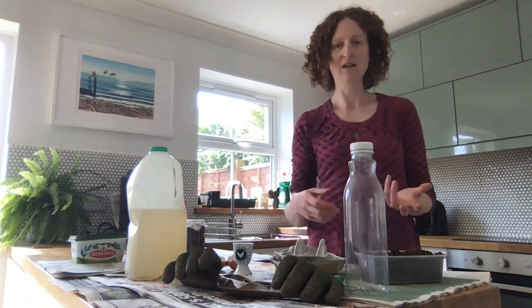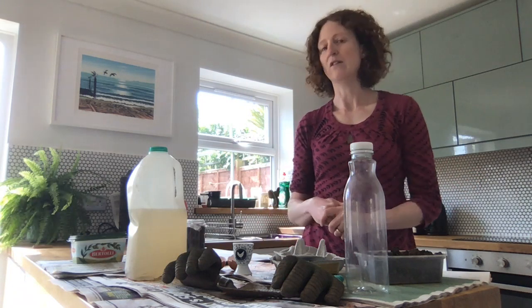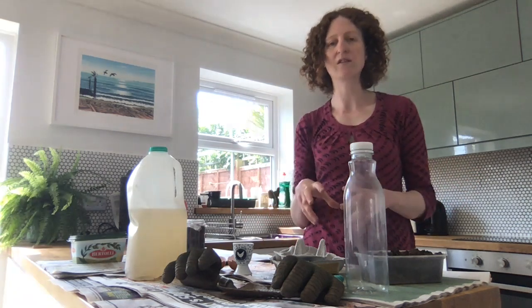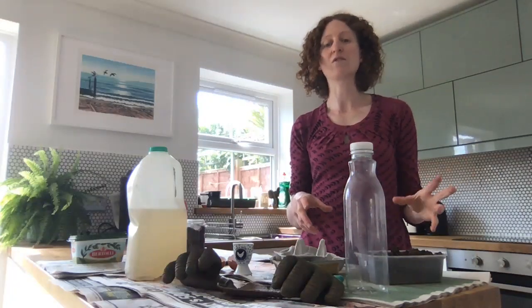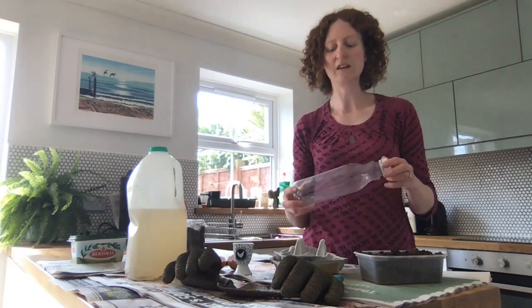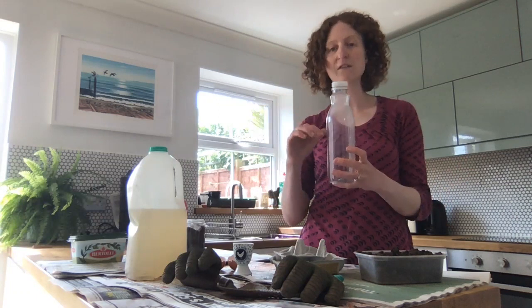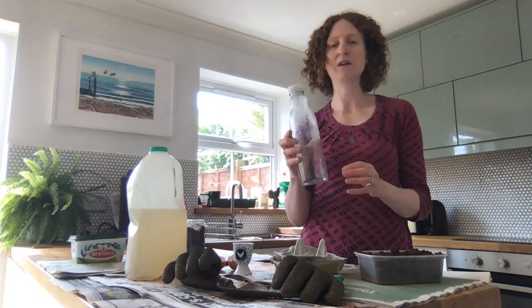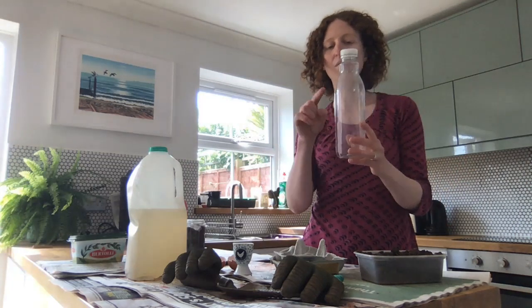So what we're going to do today is try and see what different bacteria are growing in the soils around us. You can take either mud from the bottom of ponds and rivers and lakes, or you could just dig up soil from the garden, and we're going to put it into something called a Winogradsky column. That's where we give it a bit of food, and we give it the soil, and we give it some water, and then we leave it somewhere nice and warm like a windowsill, and then we watch different layers forming within that soil.